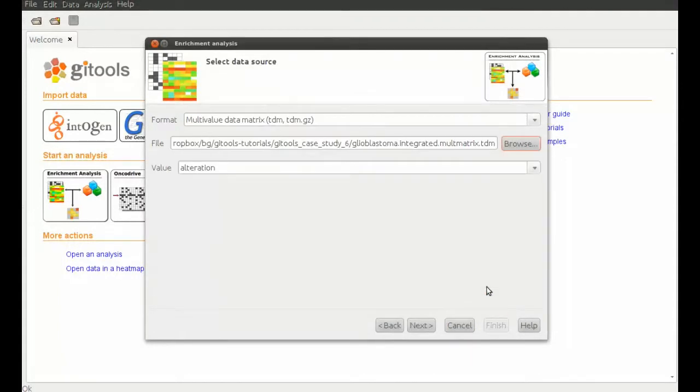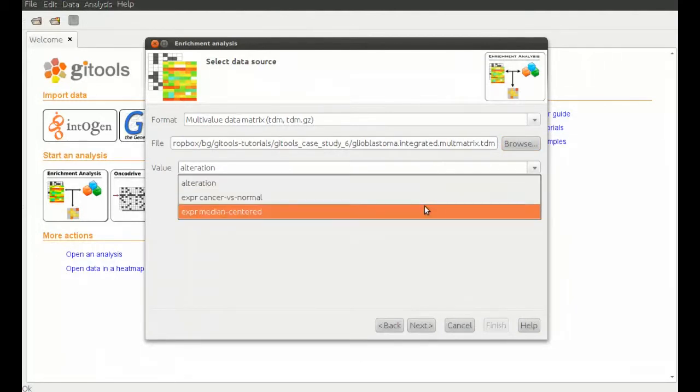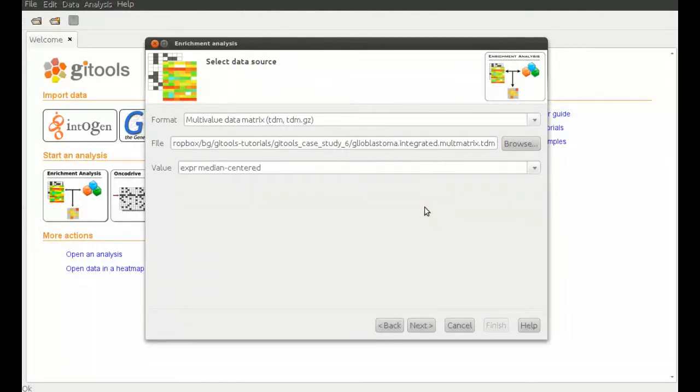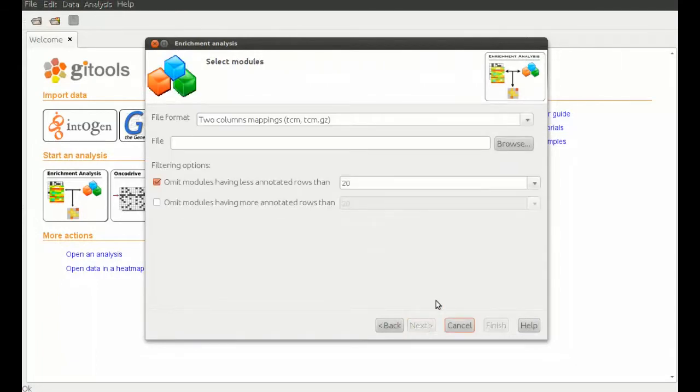We select our multi-value matrix data file and the expression median centered values. No data filtering options need to be set in the second step.